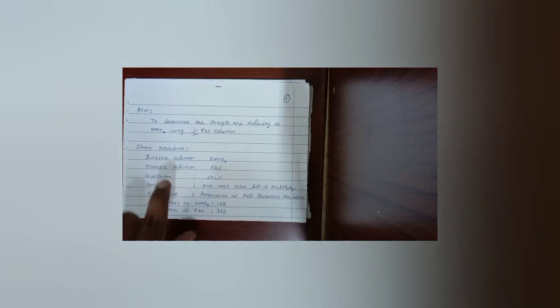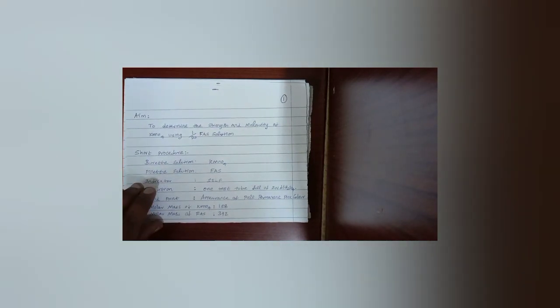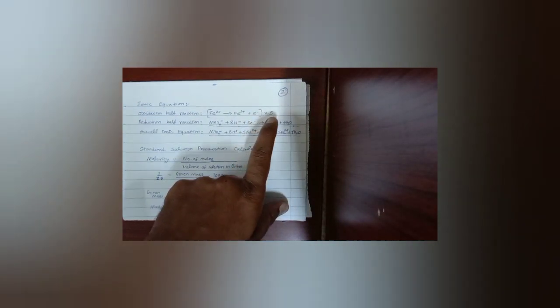So once you enter into the lab, you want to write the aim, short procedure, ionic equation, overall reaction. The overall reaction wants to be balanced. To balance only, we are multiplying by 5 and all. Then standard solution preparation calculation. It wants to be in steps.